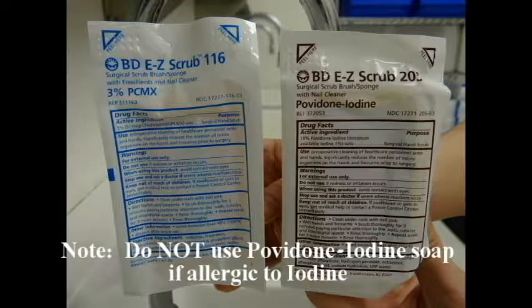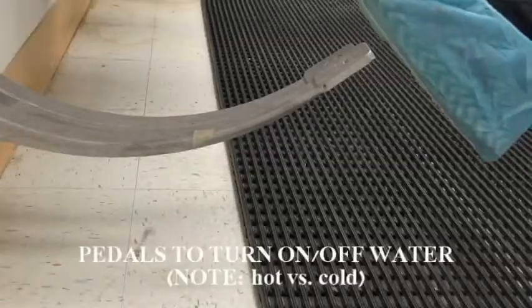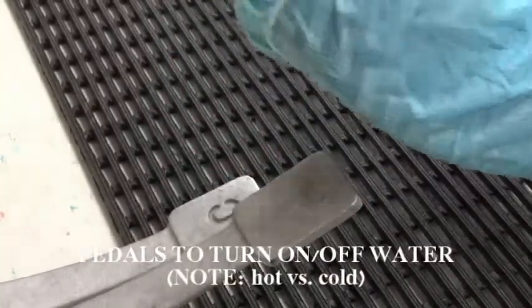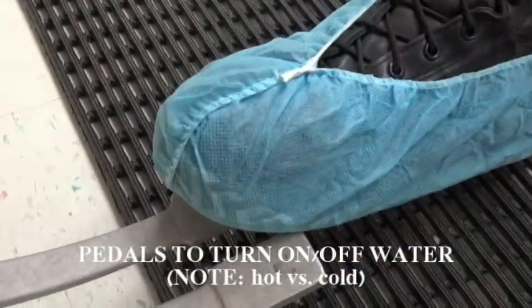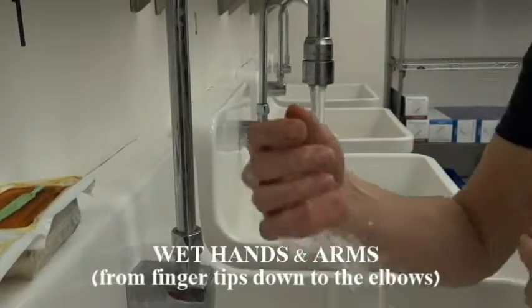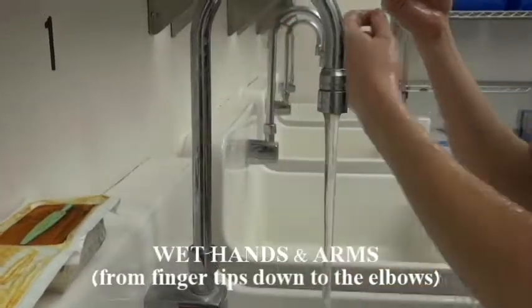Do not use iodine-containing soap if allergic to iodine. Peel the soap container open prior to wetting hands. Use the petals to turn on or off the water. Use caution to ensure the water does not get too hot. Keeping your elbows pointed down, wet hands and arms from the fingertips down to the elbow.